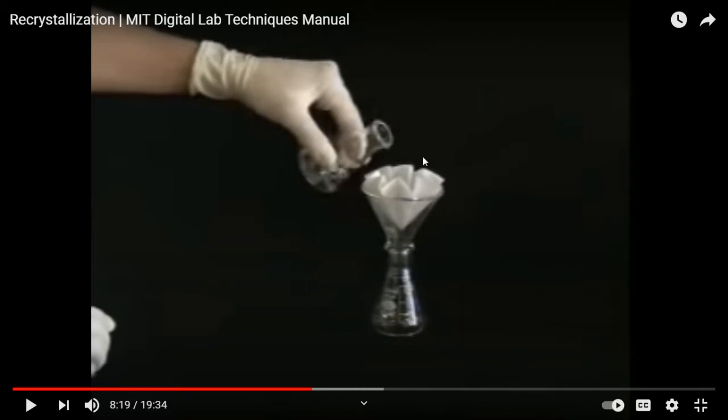So as soon as you have hot liquid dripped over the paper, it's still gonna cool down quick. And then you may see as you pour, the liquid is not gonna go down so quick. It will remain on top of the paper for a while as it loses heat energy.